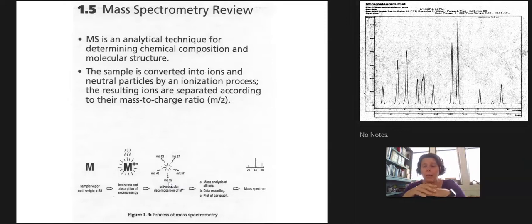So you'll get a fingerprint of the compound, and these mass specs will be very unique for your starting compound. With m/z 15, that means it has a methyl group. You can calculate all these different other ones. Here 43 is the main ion, but you'll have plus or minus a hydrogen on each side because of how it looks.